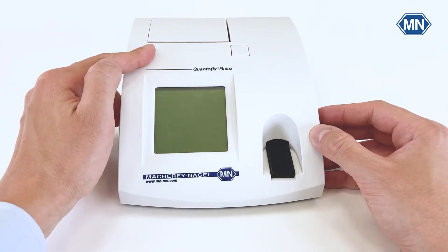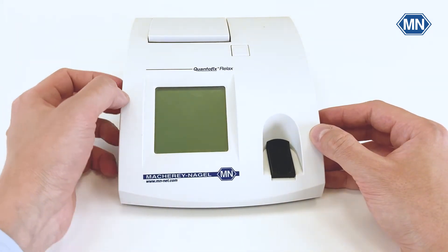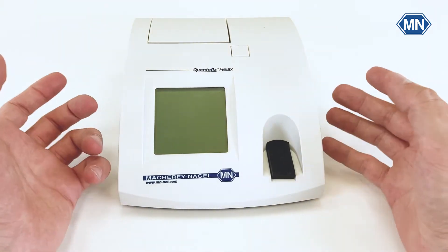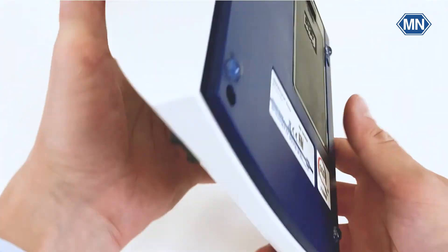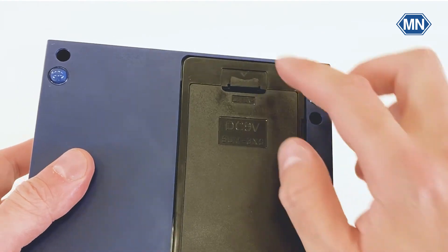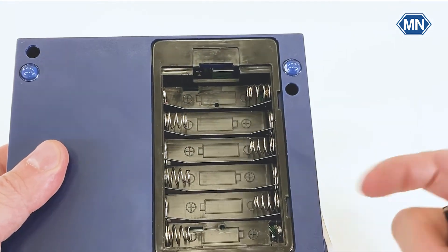On the top part is the printer flap. This can be opened with this button here. Once it's opened up, you can insert the paper, close the flap, and your photometer is ready to print out every measurement result that you got. On the bottom side, you can see the battery compartment. This can also be easily opened up and has space for six AA batteries.